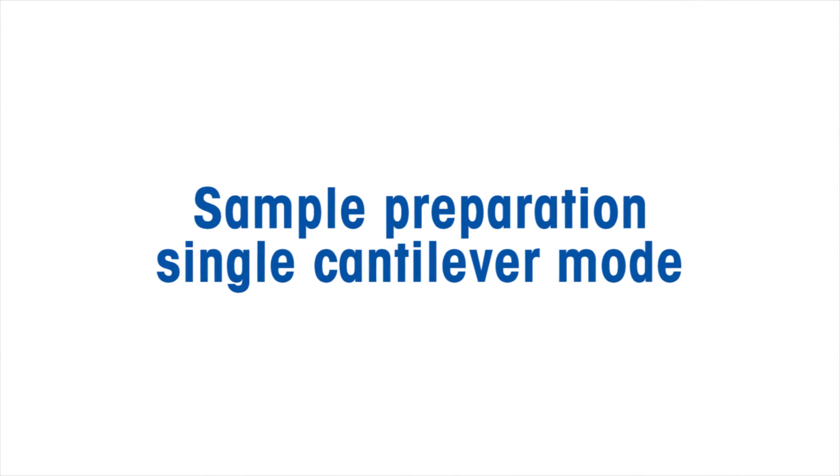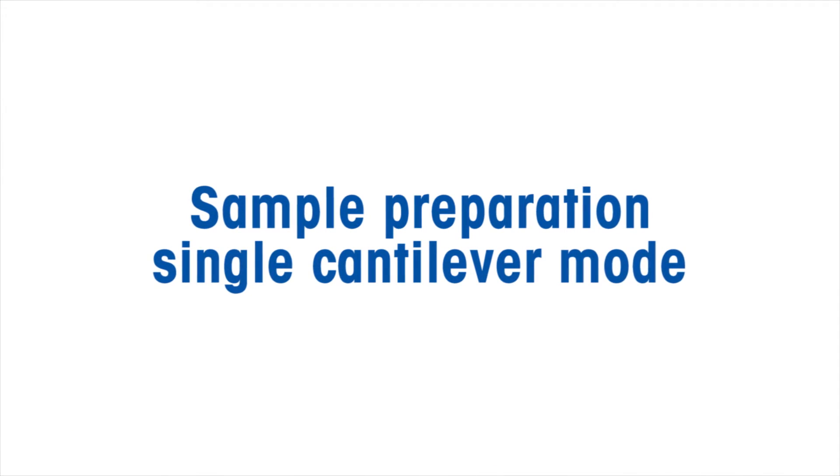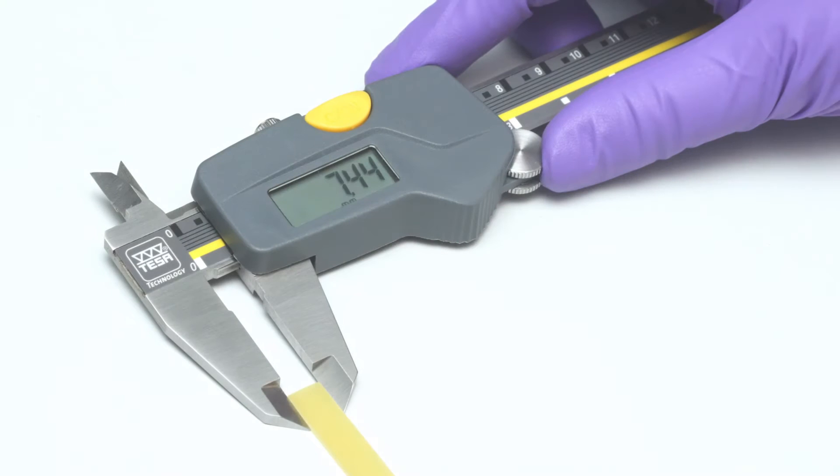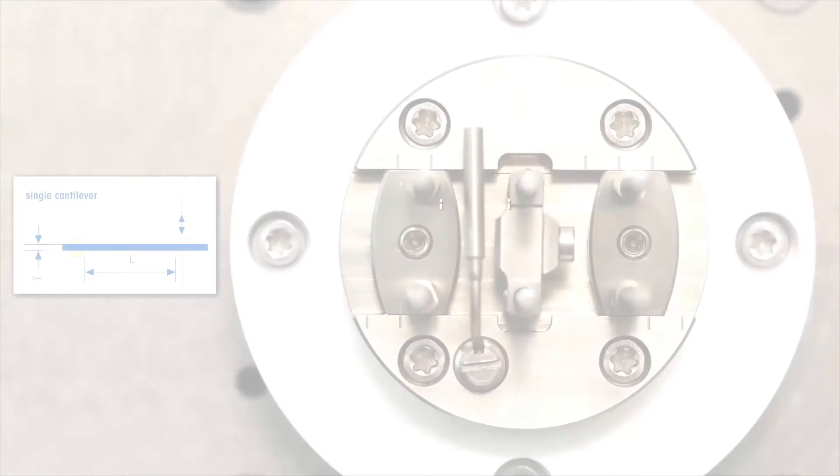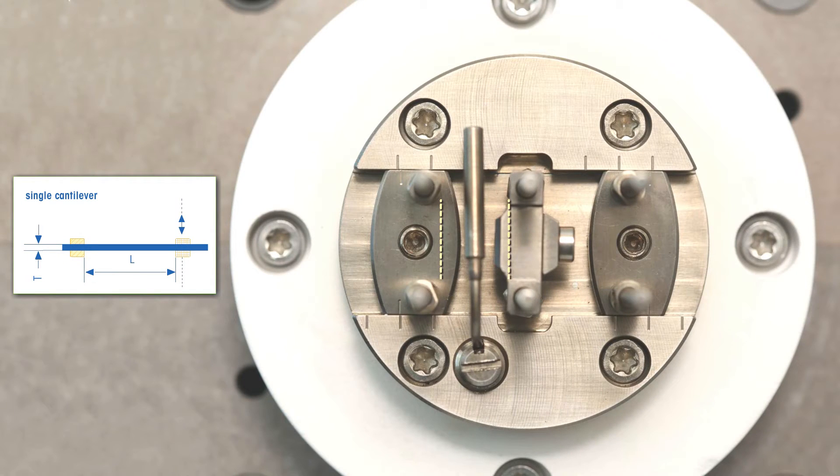Next, we will look at the sample preparation for single cantilever. First, we can measure the PCB sample width and thickness using the vernier calipers. The sample length is given by the distance of the inner to the outer clamp.